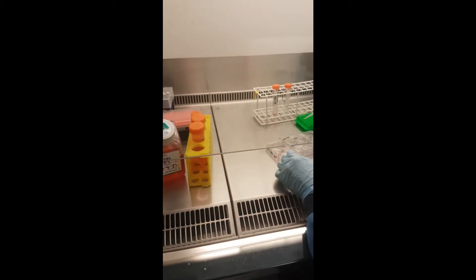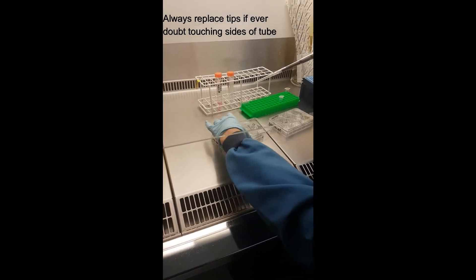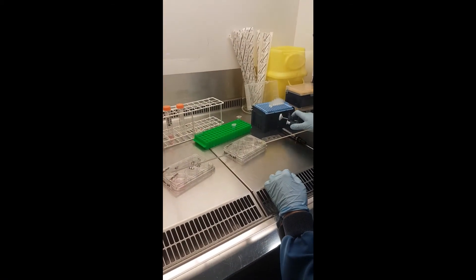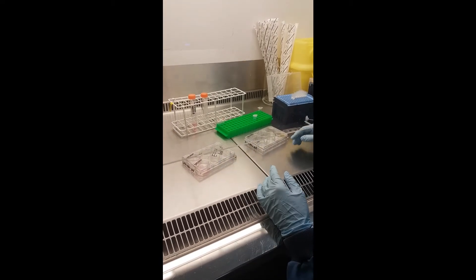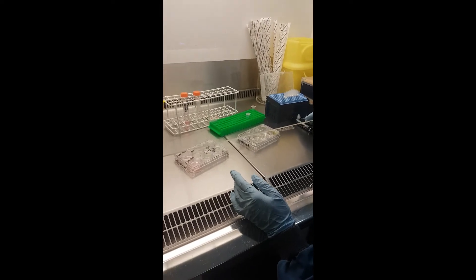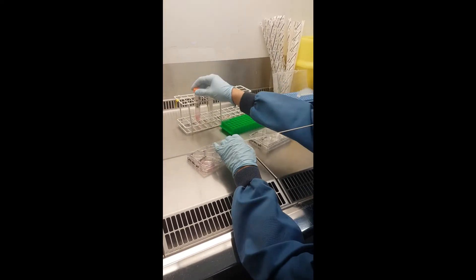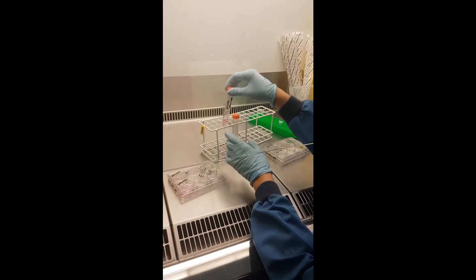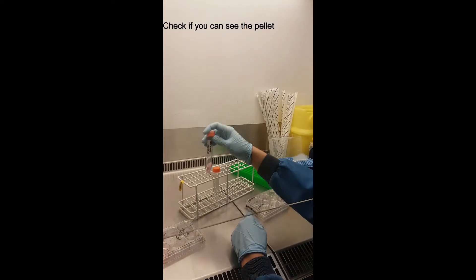If you ever doubt whether you touched the tip on the side of a tube or something else, just replace it. Be really careful not to mix up samples — if you think your tip has been in another tube, take a new one. It's better to replace and avoid the risk of contamination.